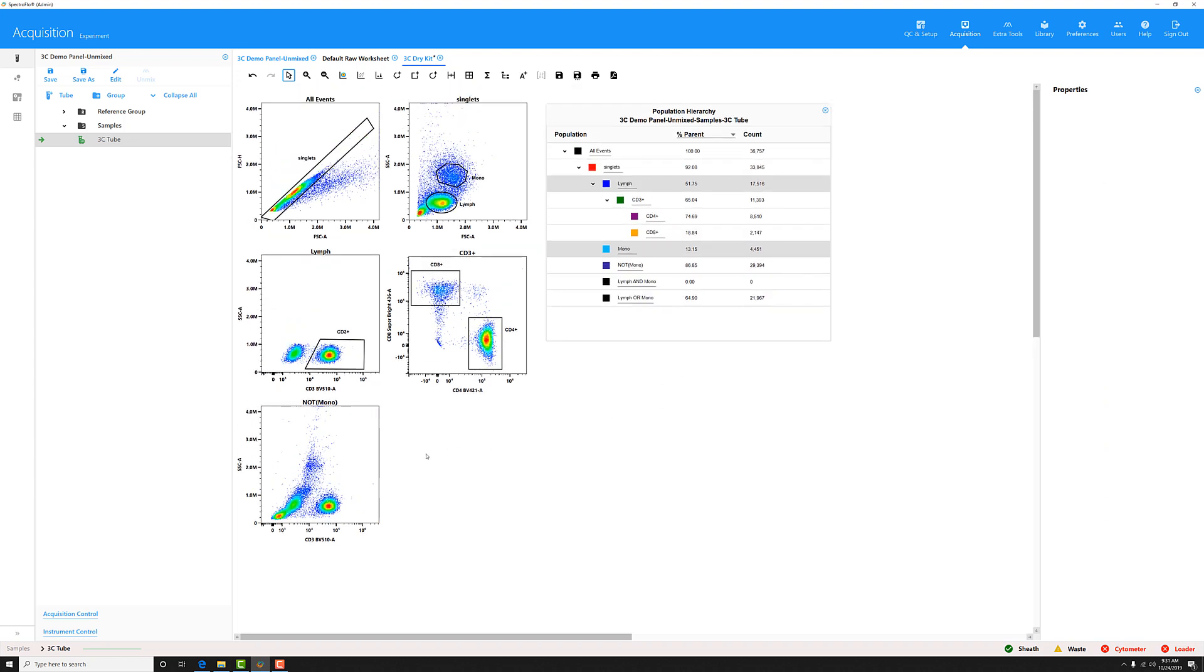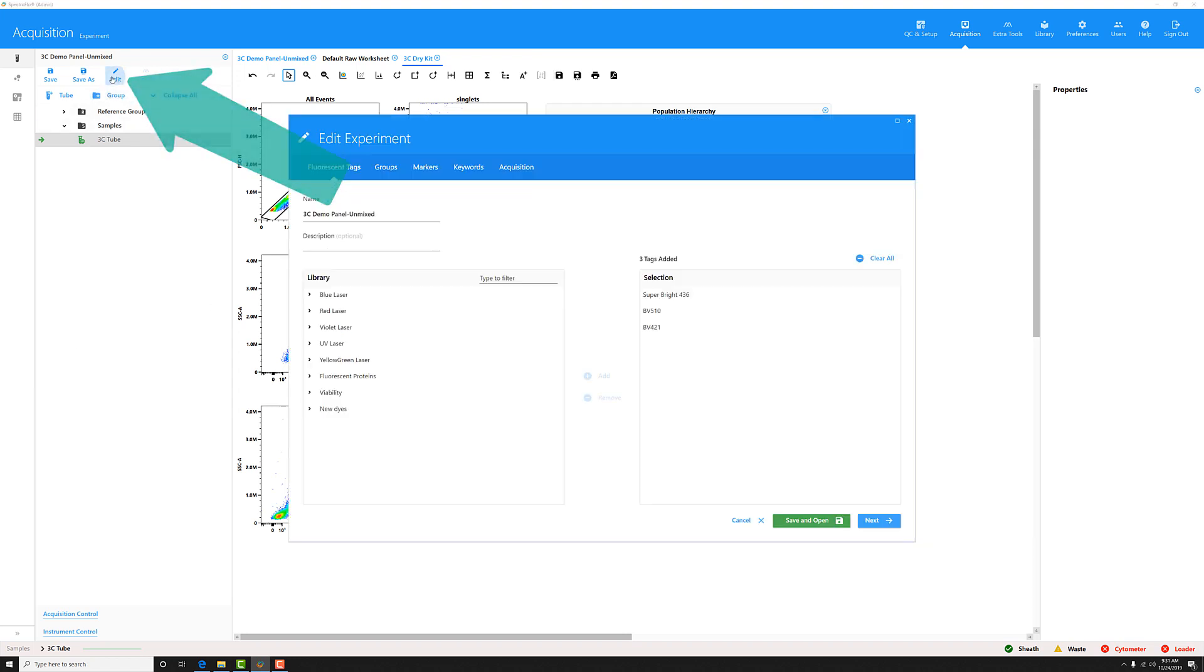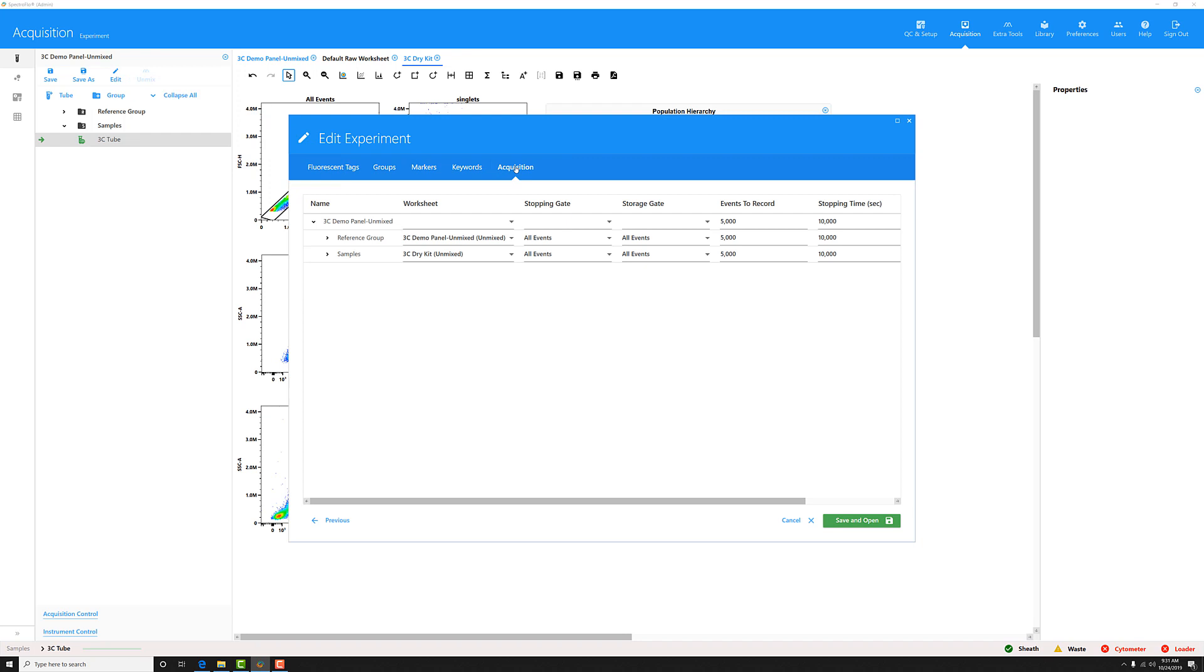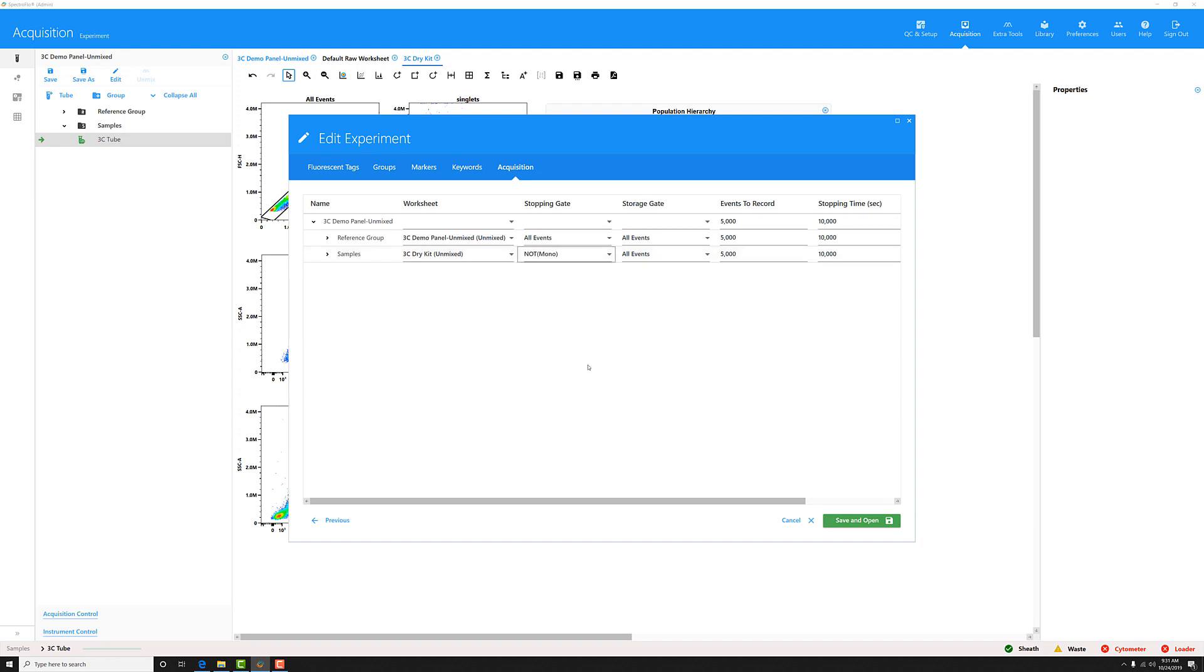Once I've created these different Boolean gates, I can also use them as stopping criteria. First, I have to save my changes in my worksheet. Then I can click edit to open my experiment editor and go to the acquisition tab. Once there, I can select the worksheet that I have, my three color dry kit. And under stopping gate, all of the new gates I've selected are now options that I can use as my stopping criteria.